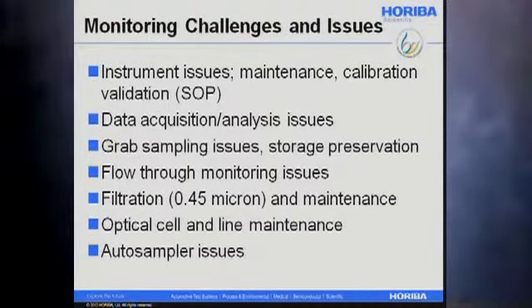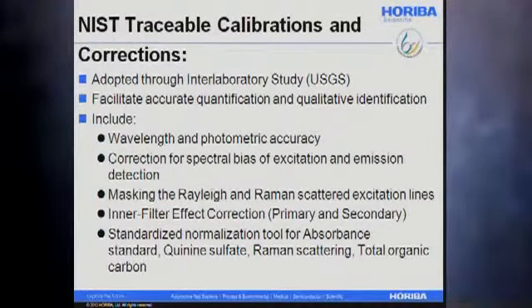Of course, there are challenges in terms of any type of online system: maintenance, calibration, data acquisition, analysis, grab sampling and storage, especially with algal contamination, fixing samples, flow-through monitoring, filtration, and maintenance. But again, nothing that is insurmountable, and it's something that we're very much looking forward to in future applications.